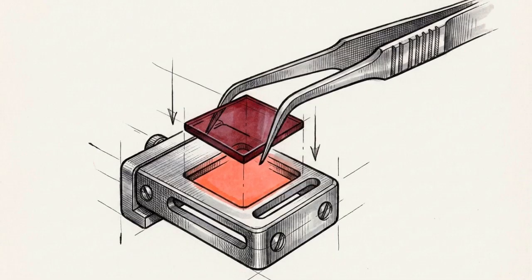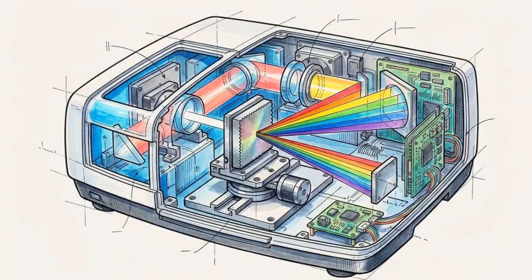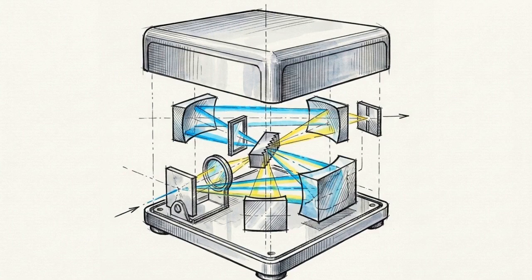Fortunately, the fix is entirely passive. A cheap, standard glass absorption filter placed in front of the slit easily absorbs the higher-order stray light before it ever hits the grating. The diffraction grating dominates optical design because it delivers consistent linear resolution across the spectrum, and the cost of its single physical flaw is simply adding a basic piece of colored glass to the assembly. Filters, slits, and gratings do not function in isolation. They extract precise data only when properly aligned inside a complete monochromator system.